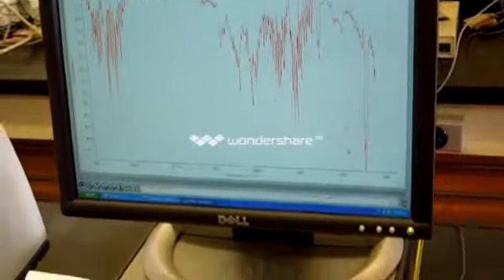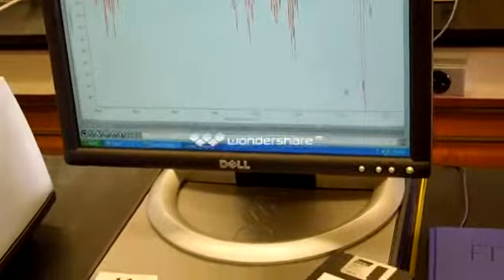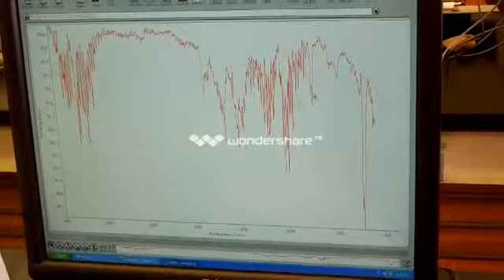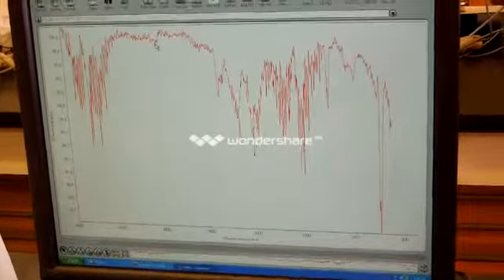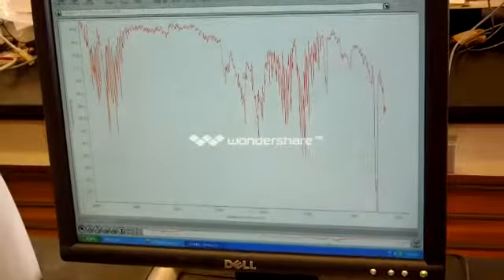In addition to using this functional reference chart, I also have this here, which is pure dichloromethane, and this will show that same ring at 700. In addition to that, we have a peak showing up here, which is a CH bond, and then right at 3000, not as pronounced on this one, you see a small peak here, and that's also another CH bond. The rest of these peaks here, which are not in my pure sample, are more than likely some type of contaminant.